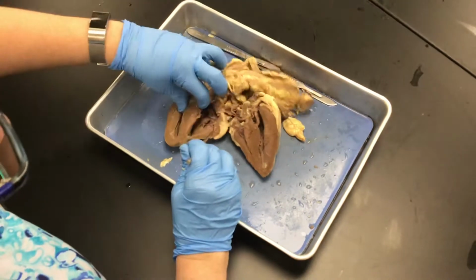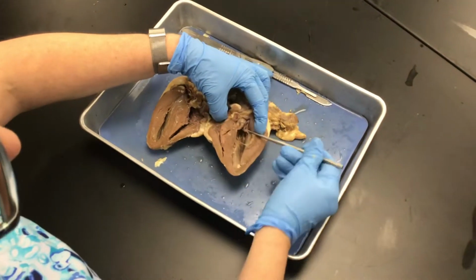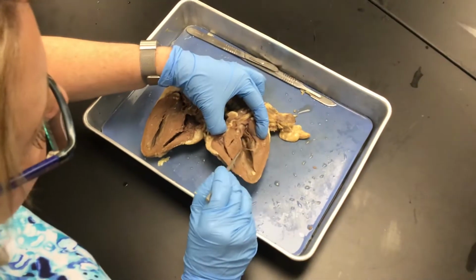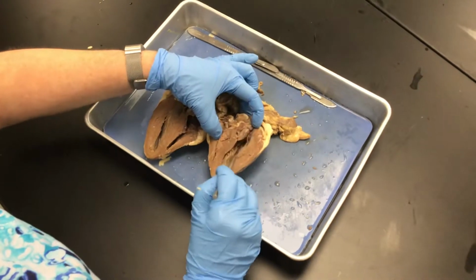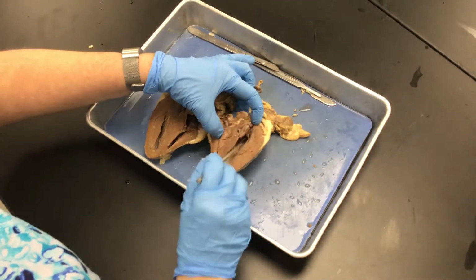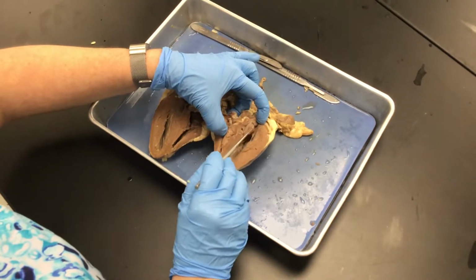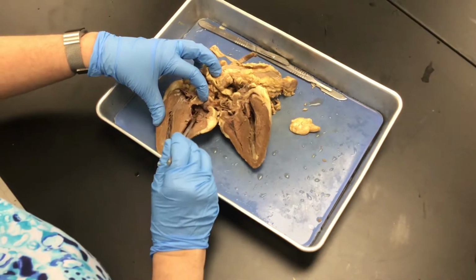Okay, next thing we're gonna do here. Okay, we're gonna find this valve right here. These are the chordae tendineae. These little guys right down here are the papillary muscles that hold the chordae tendineae. Chordae tendineae are only found on AV valves, atrioventricular valves. So since this is the left ventricle, we know that this is the bicuspid. This is the right ventricle, so we know that this is the tricuspid right here.